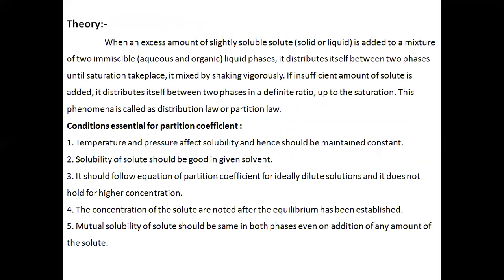Theory behind this experiment is when an excess amount of slightly soluble solute, that is solid or liquid, is added to a mixture of two immiscible aqueous and organic liquid phases, it distributes itself between two phases until saturation takes place. It is mixed by shaking vigorously. If insufficient amount of solute is added, it distributes itself between two phases in a definite ratio up to the saturation. This phenomenon is called as distribution law or partition law.